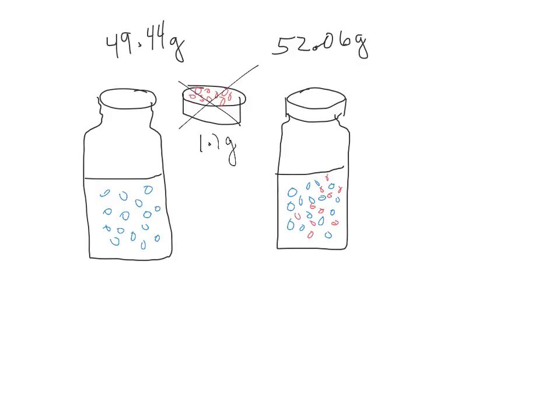The sugar is another 0.5 gram-ish. I'd say 0.5 to 1 gram. So what does that translate into? That translates into about a 2.5 gram jump from here to here because you'd never massed this part. All right, I think that's it.